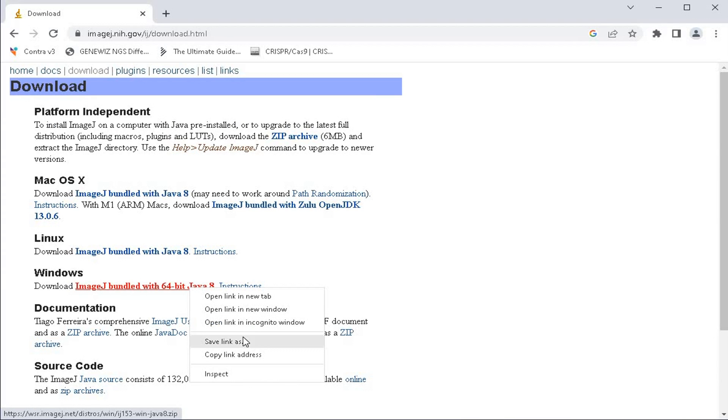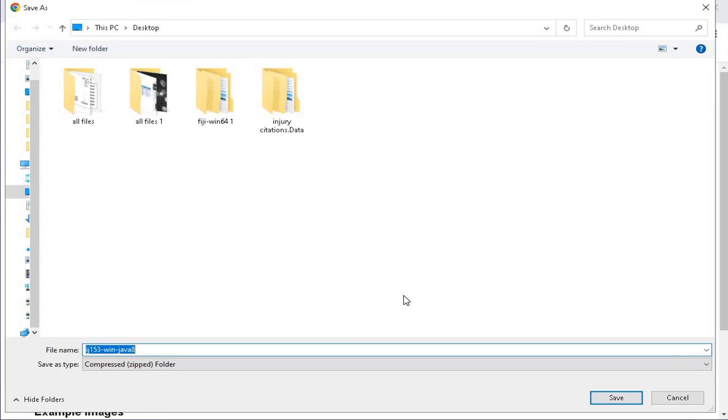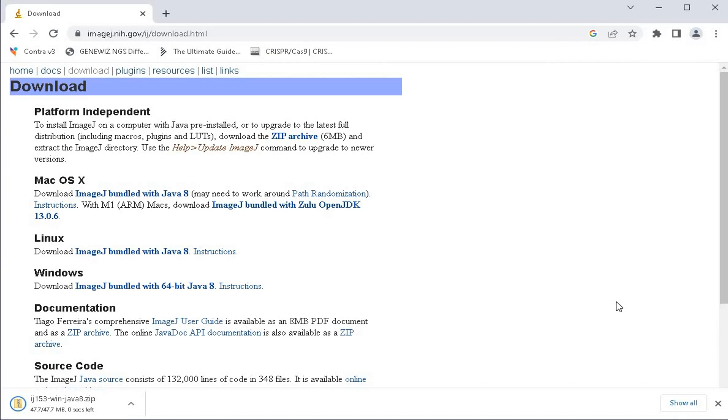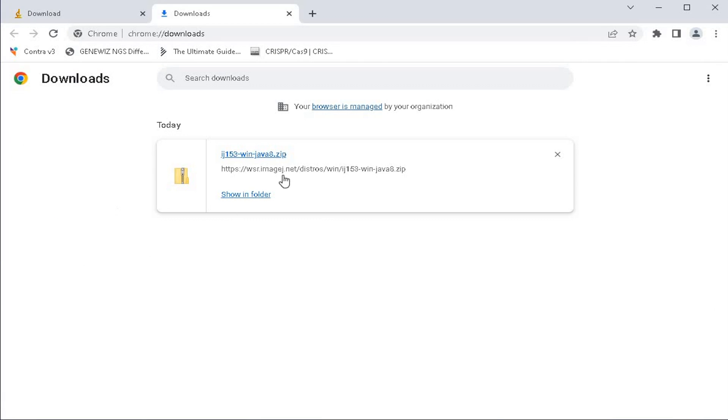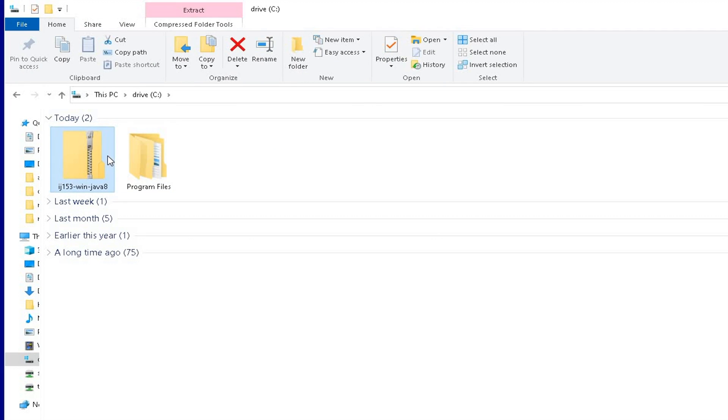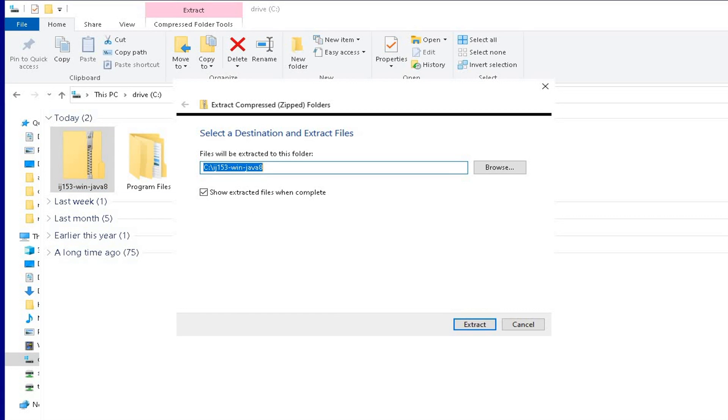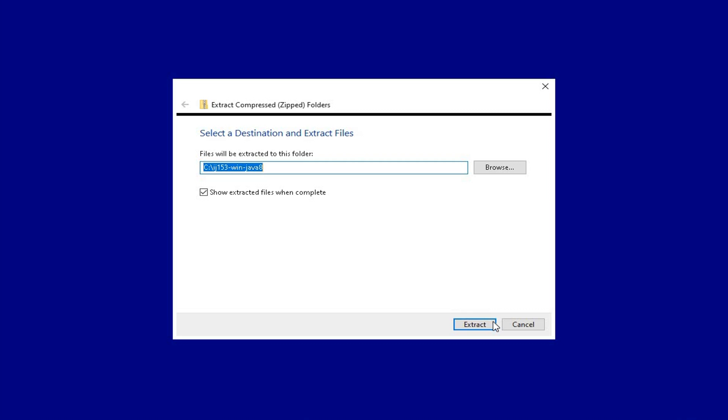Select the ImageJ version for Windows to download the software. Once download is completed, locate the software which is a compressed file. Use appropriate software to extract the file.